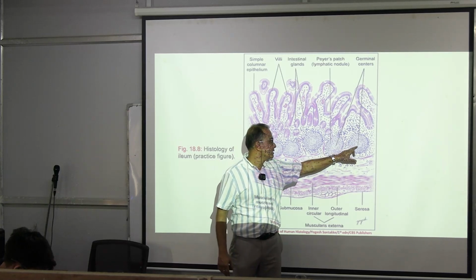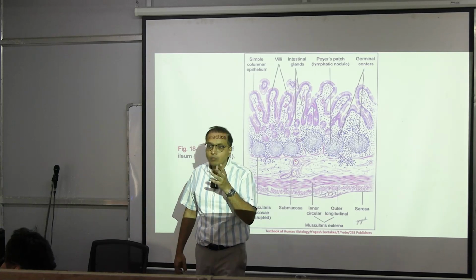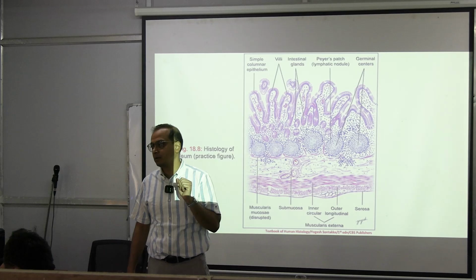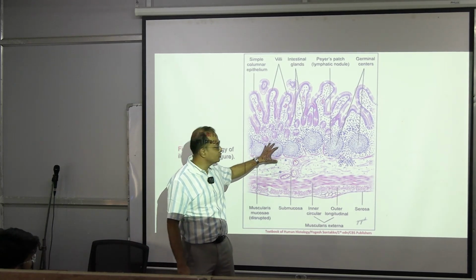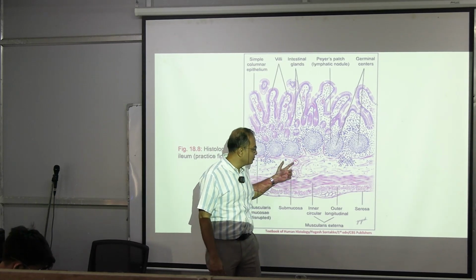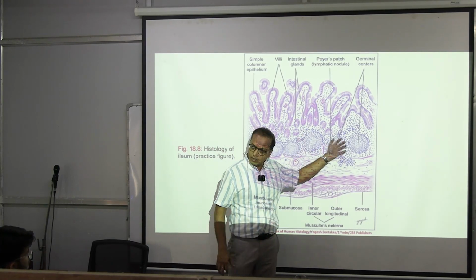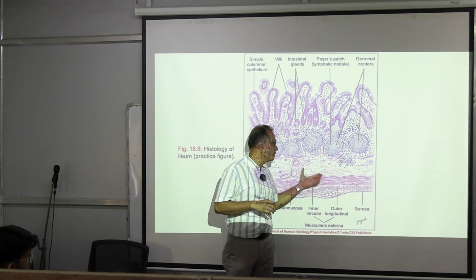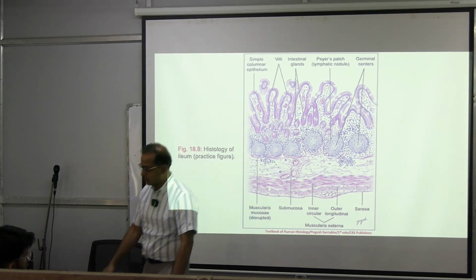These lymphoid aggregates you are seeing, 1, 2, 3, 4, 5, are pathognomonic or a hallmark for the small intestine specimen present in the ileum segment. It is present in this region. Ideally it should be at the lamina propria level. Some books write the submucous level, but it may reach the lamina propria, which is present in the mucous coat, and if it enlarges and becomes bigger, it may reach the submucous layer as well. So, that is why it looks like this.